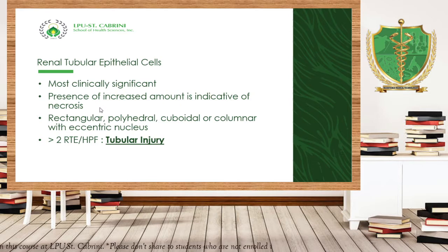Again, remember, this is the most clinically significant epithelial cell, followed by transitional epithelial cells, followed by clue cells. Squamous epithelial cells are not considered clinically significant. However, they become pathologically significant if there is ingested bacteria on the cytoplasm.